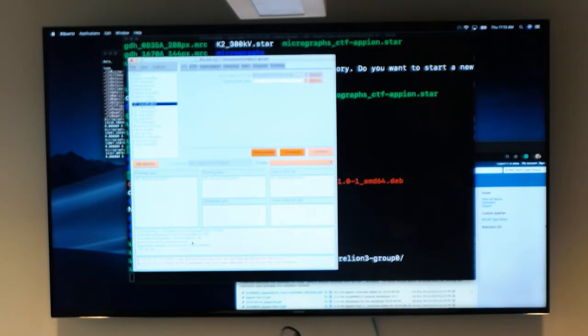Okay, so what you have to be careful about is your directory structure. Right now I'm linking a couple up, but if I move this away, the way I symbolically link it, it wants to go up 2 directories. If I put it in another directory, it'll go up, but not enough.